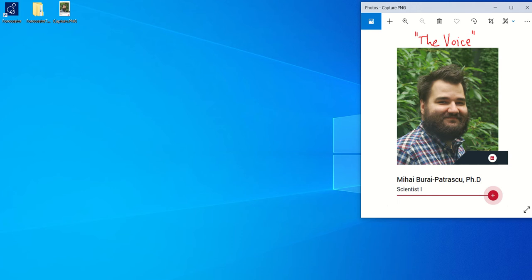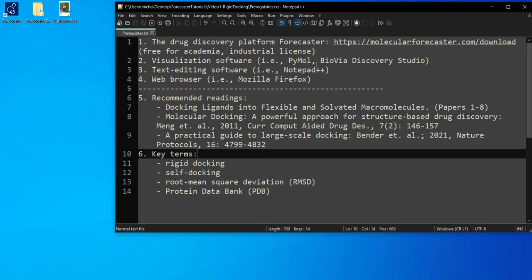Today's tutorial will deal with rigid docking and as prerequisites we will need Forecaster which you can download at this link. As a note, Forecaster is free for academia. If you are part of an industrial company you will need an industrial license.